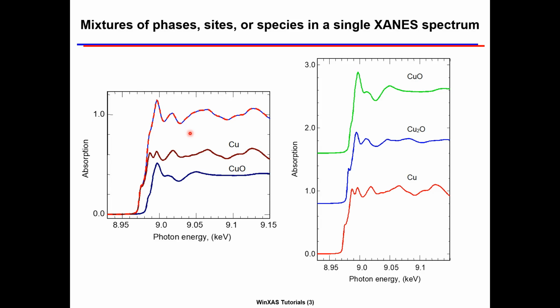While there is little one can do when analyzing a single spectrum, alternative procedures exist for the analysis of a series of sample spectra.